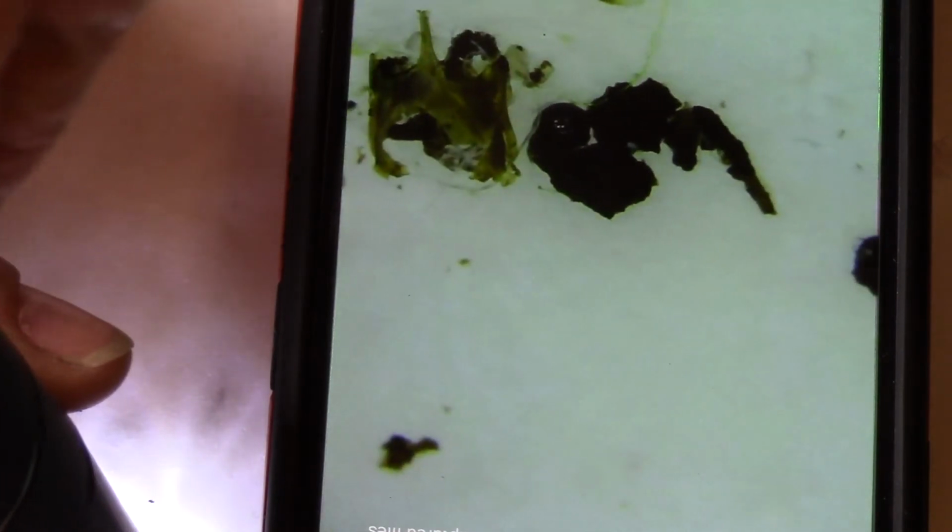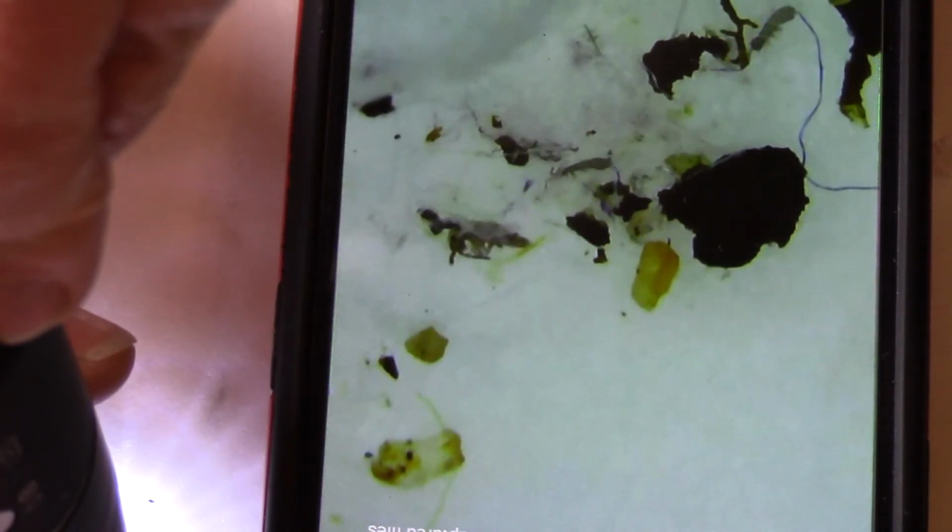I'm going to try, because I have access to a slightly better microscope, but I think if this is as far as you get, where you get some maybe mites and some springtails, and you can get that far, like that springtail was very obvious under this microscope. All right, let's see if I can find that maybe a mite. Those will just look like pieces of rock.